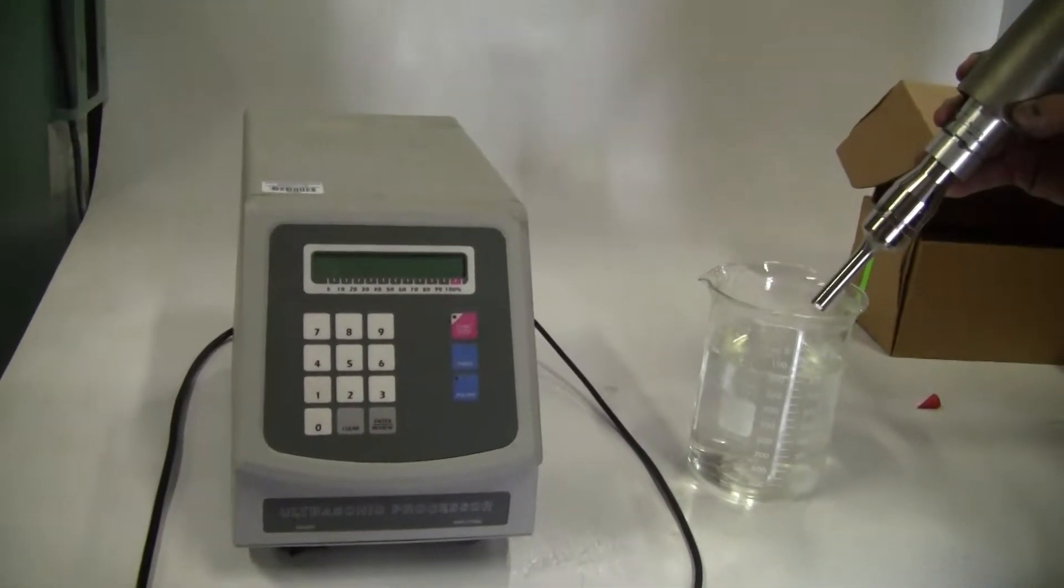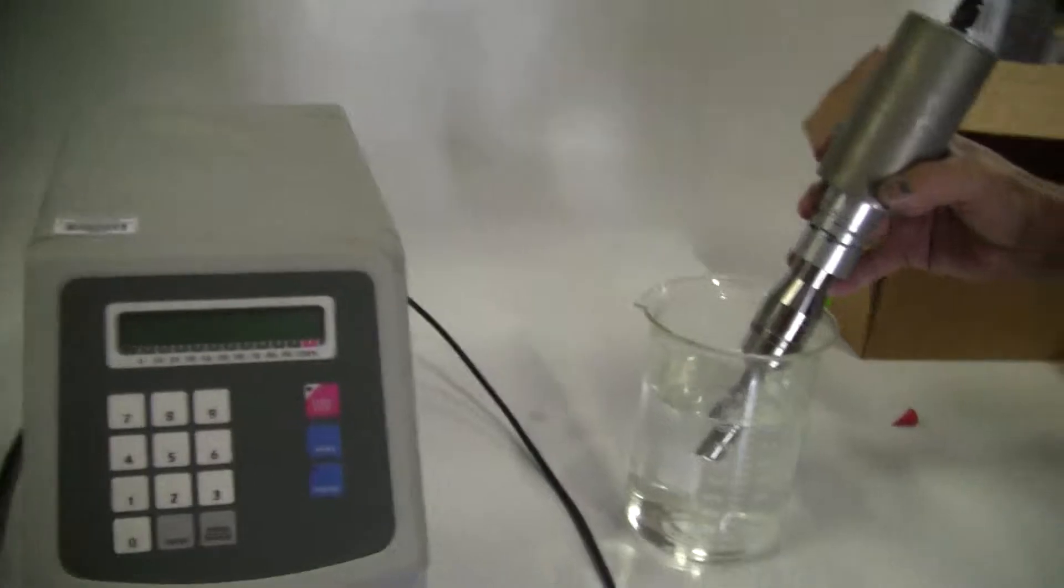Hi, this is Jim from HitechTrader. We're looking at the ultrasonic processor. I'm going to take a look at it working.